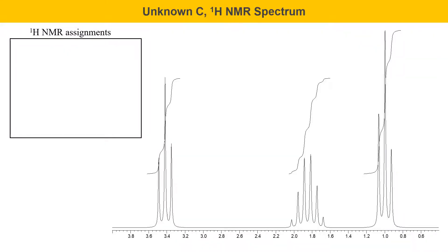Here's the proton NMR spectrum of unknown C, and there's a lot of rich detail here in terms of splitting. We have a triplet, a sextet, and another triplet. This splitting will be really important for solving the molecule. So will the integrations and the chemical shifts.